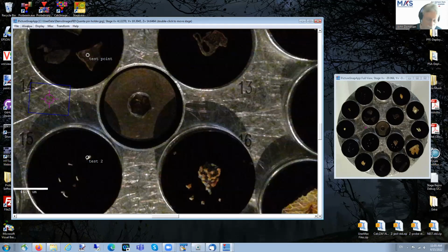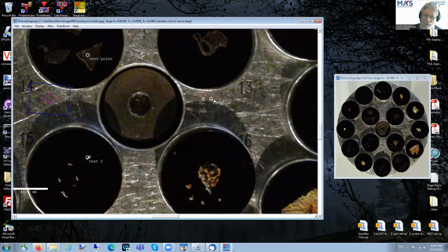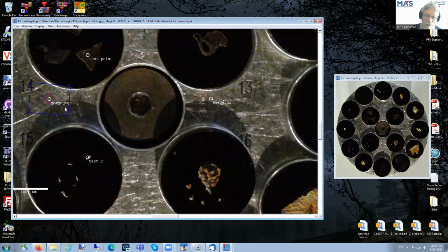So you can do that with a point. You can either right click and enter some text in, and it will put that text wherever you clicked. So if I type in gobbledygook, then it's going to put that right where I right clicked. If I want to be at the spot where I actually am, you can do a shift P, I think, and then you type in some more gobbledygook, and then that's going to be at current point there.